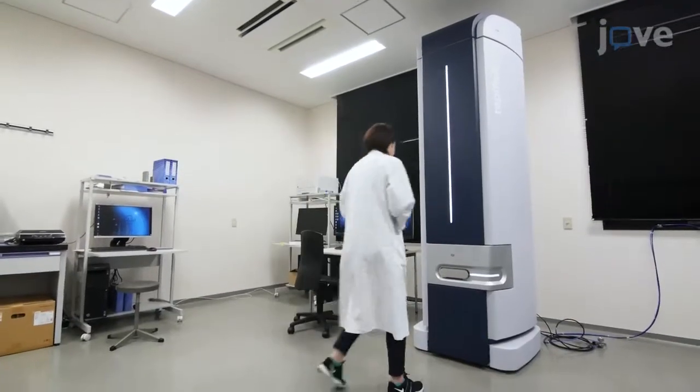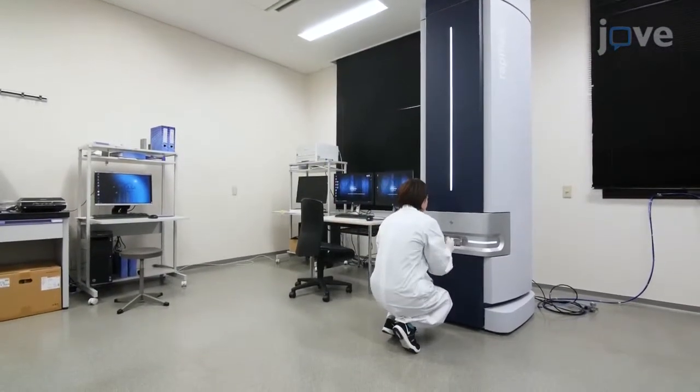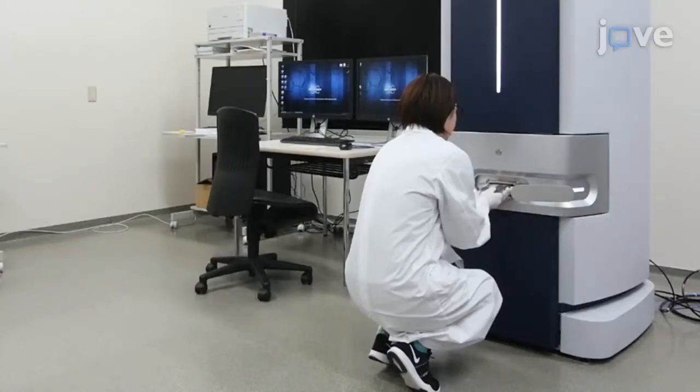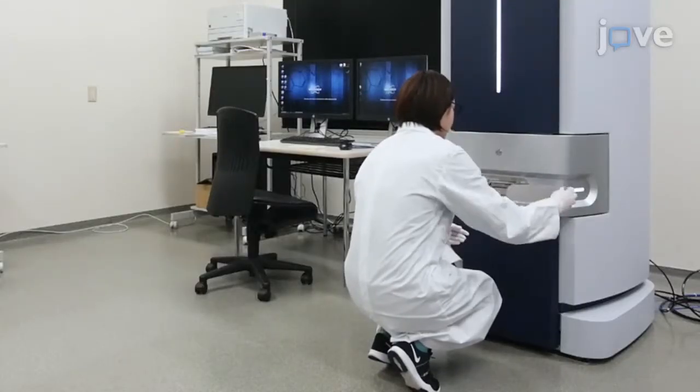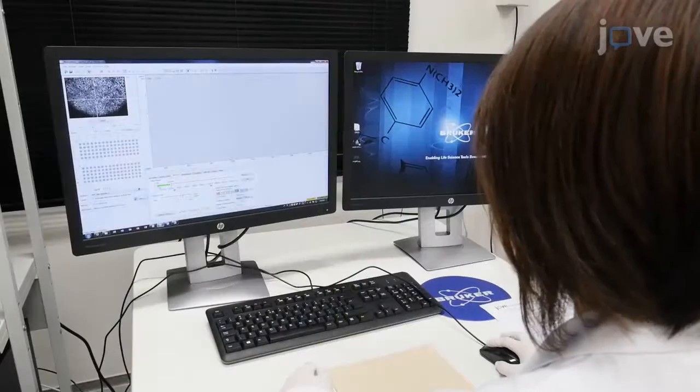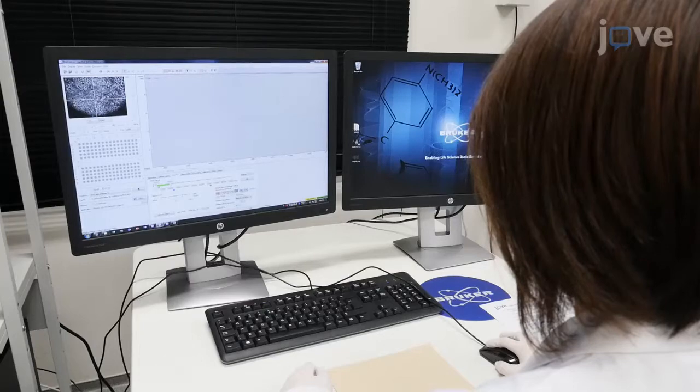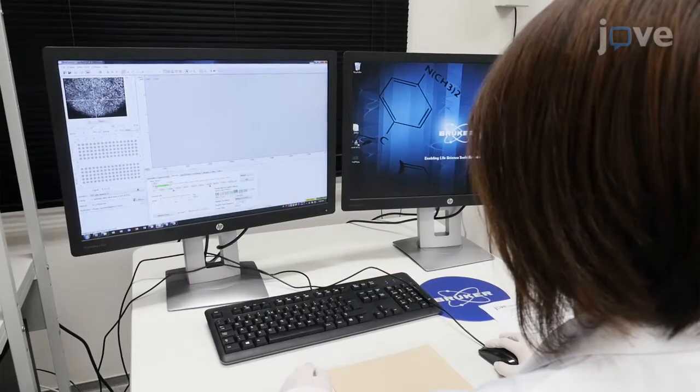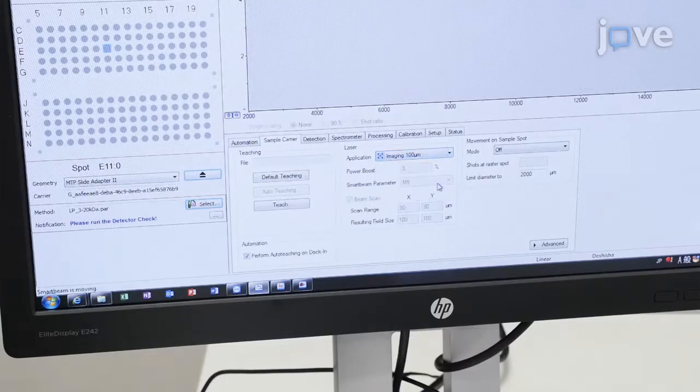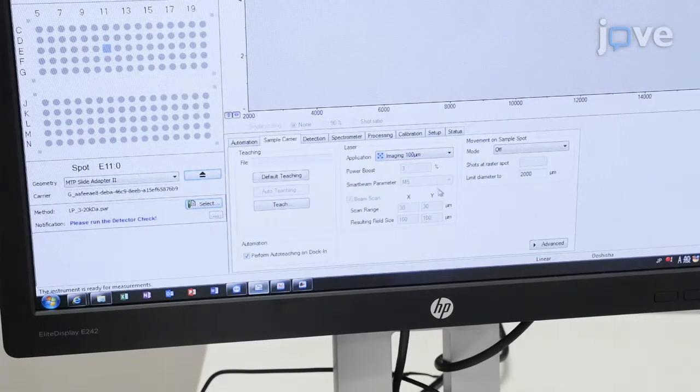Perform high throughput and high spatial resolution imaging experiments with MALDI IMS. For mass spectrometry measurements, define the tissue areas using the MALDI control software and data analysis software. Acquire spectra in positive linear mode with a mass-to-charge ratio range of 2,000 to 20,000 and a spatial resolution of 20 and 100 microns.